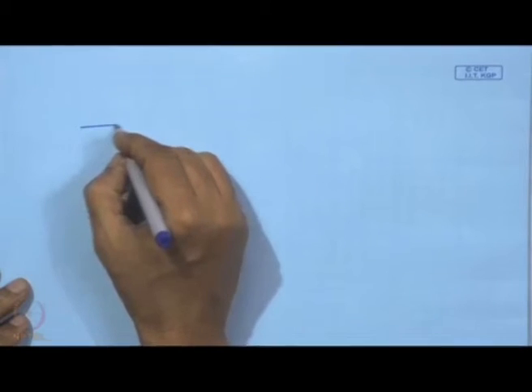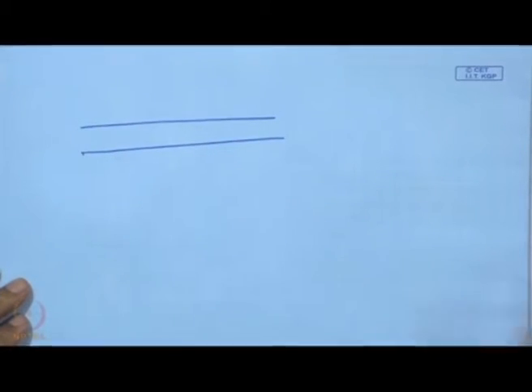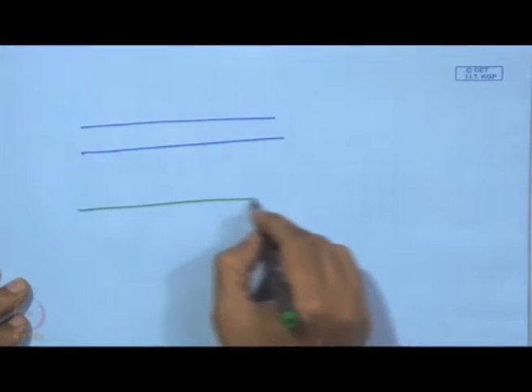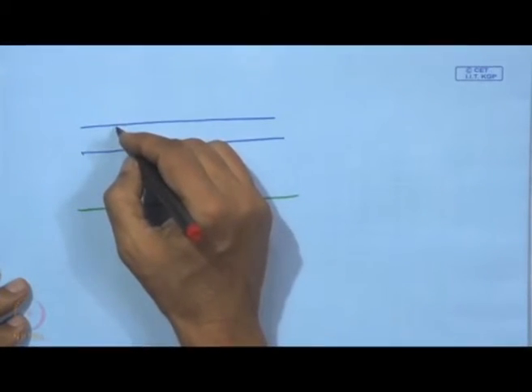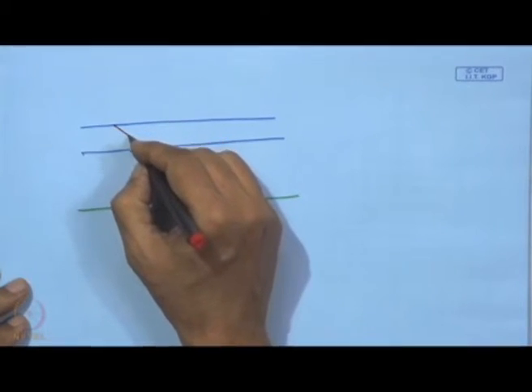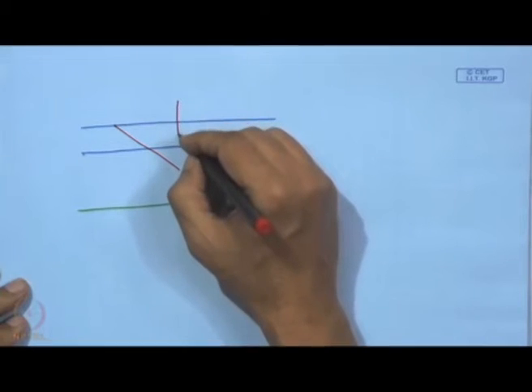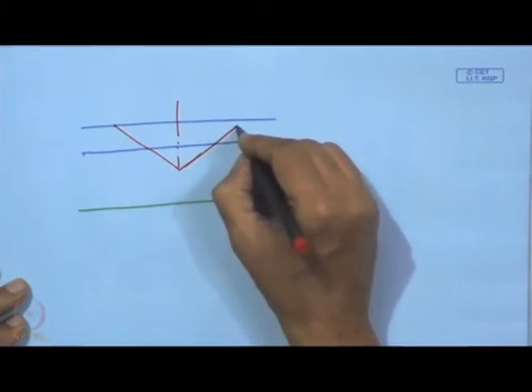is the coating and just beneath it we have the substrate, and here we have this indenter. So, the indenter has come to this depth. This is the depth of indentation, and this one is the impression.